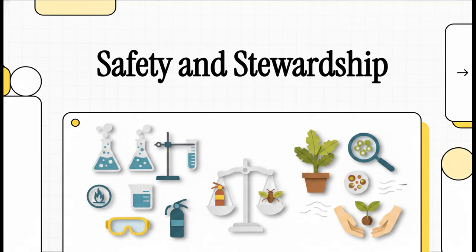When we talk about running a lab, we're really talking about balancing two massive, totally distinct responsibilities. On one hand, you've got the rigorous management of hazardous inanimate materials. We're talking your chemicals, your glassware, your electrical equipment. On the other hand, there's this incredible, profound responsibility of acting as an ethical steward for living subjects. It's a dual mandate, really. Strict, rigorous safety on one side and deep empathy and stewardship on the other.